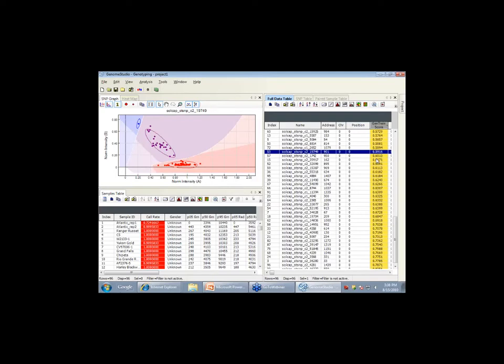So from what we've seen, we're fairly new on this. We've tested about a dozen diploid species and about 500 lines in total with this data, and we've had a very good success rate on the calls. We had very few missing data points.